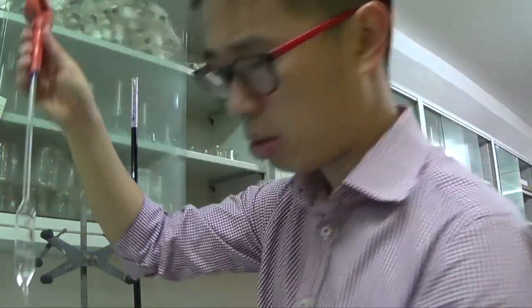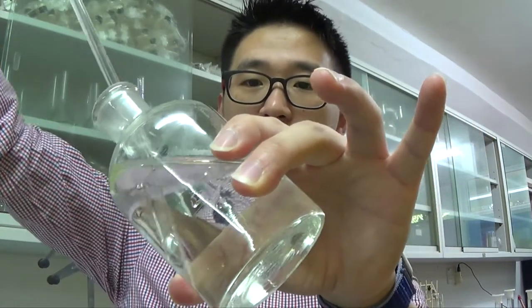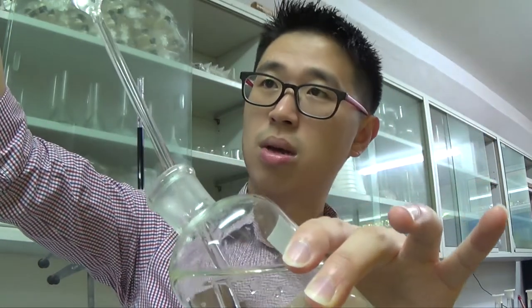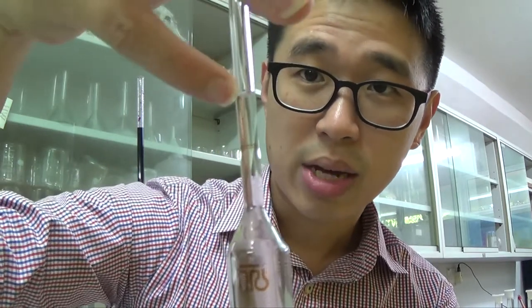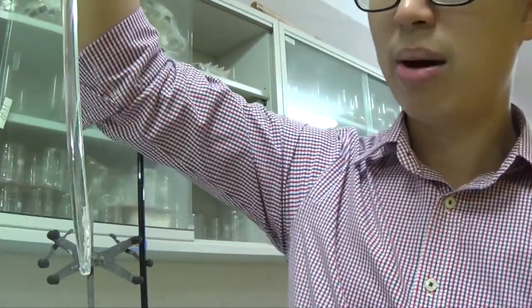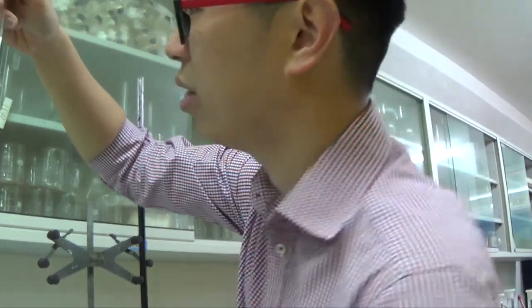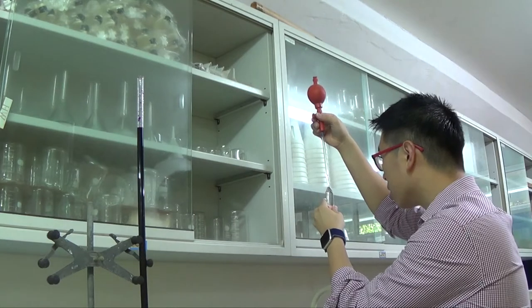So typically when we want to take the solution out with the pipette, we'll hold it at an angle, okay? We'll hold it at an angle and then we will suck it up. We always like to suck up higher than the line itself, because when we suck up higher than the required line, it's about there, but the line is around here. Then I'll take it out, no air bubble inside. Then I'll eject it at eye level until I reach whatever volume I need. Eject slowly.